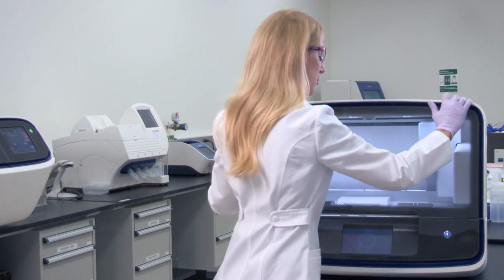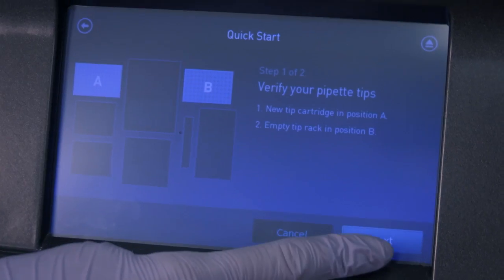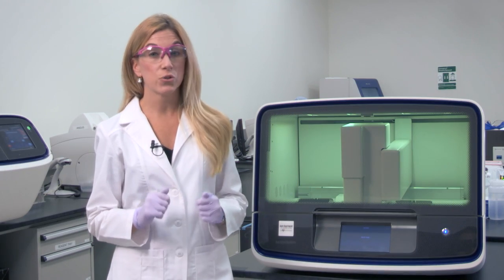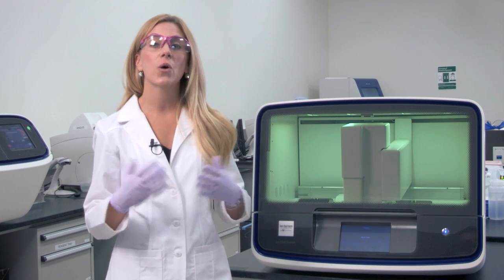So now all you have to do is start your run. And don't worry if you think you made any errors — the Ion Chef will prompt you to check to make sure all of your consumables are in the correct position. After seven hours, you're going to have up to eight libraries, normalized and pooled, and you'll be ready to go on to your next step, which will be template preparation and chip loading.